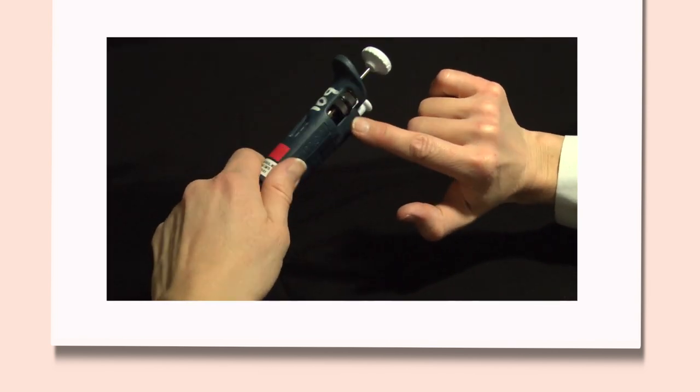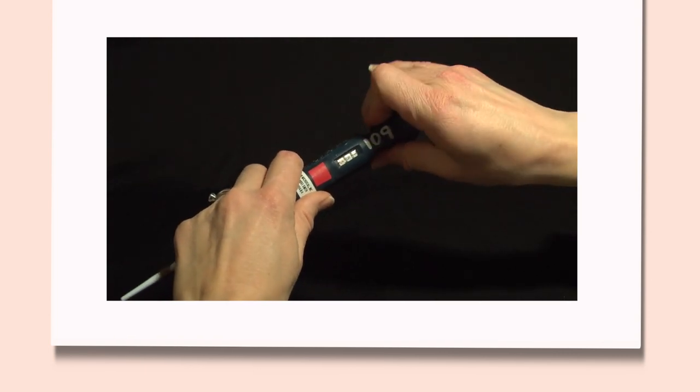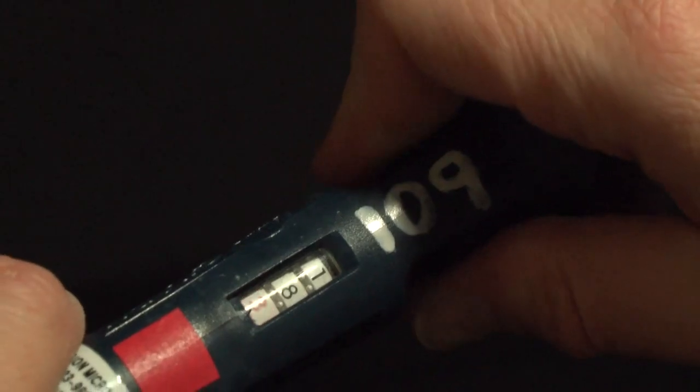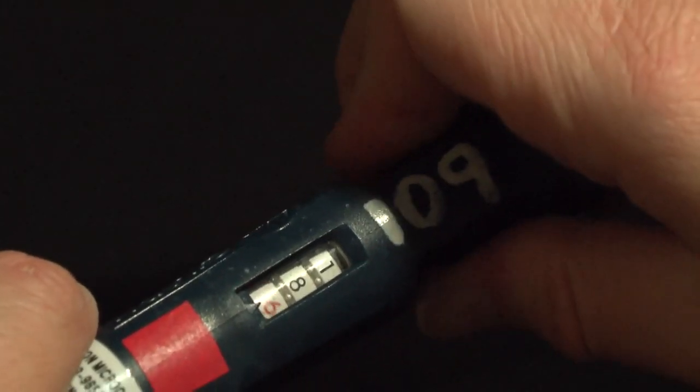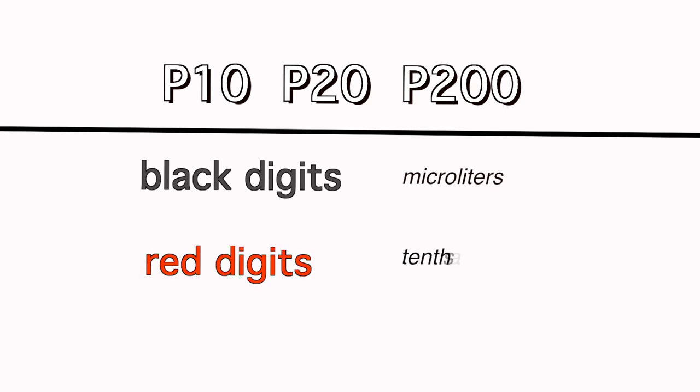Volumes are set using the black ring or top plunger knob. The volume to be dispensed is read on the indicator along the body of the pipetter. This volume indicator consists of three digits which are read from top to bottom. For the P10, P20, and P200, the black numbers refer to the number of microliters, and the red digits indicate tenths and hundredths of microliters.